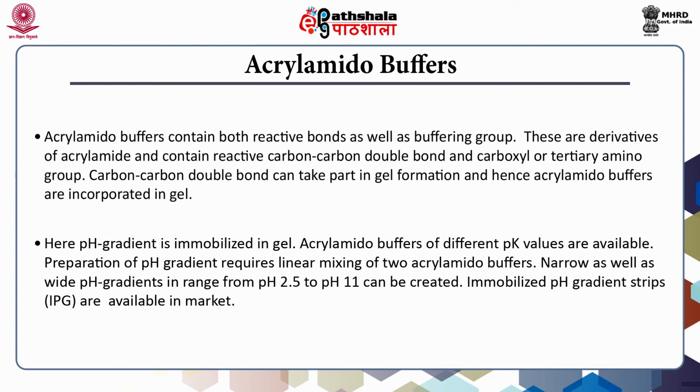Preformed thin isoelectric focusing gels are now commercially available for different ranges of pH values. Isoelectric focusing can be performed by using immobilized pH gradient strips, popularly referred to as IPG strips, available in the market. IPG strips are very simple to use. These are stable even during extended running of isoelectric focusing. Generally, broad range strips are preferred for resolution of protein. The pI values of most proteins are in the range of 3 to 10.